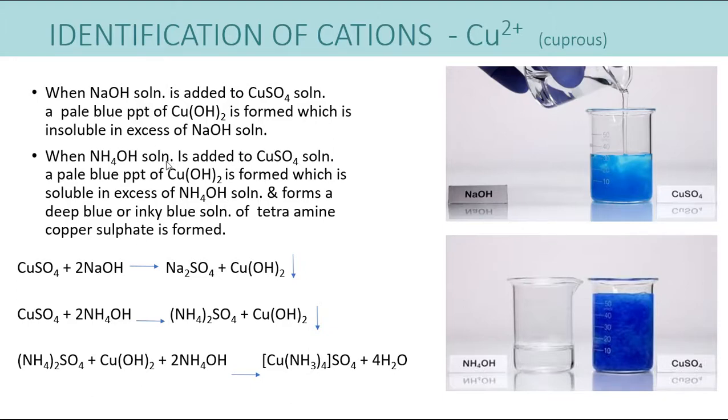When ammonium hydroxide solution is added to copper sulfate solution, you can see a pale blue precipitate is formed, and when you add excess of ammonium hydroxide solution, the precipitate dissolves to form an inky blue solution of tetraamine copper sulfate. So here are the equations.